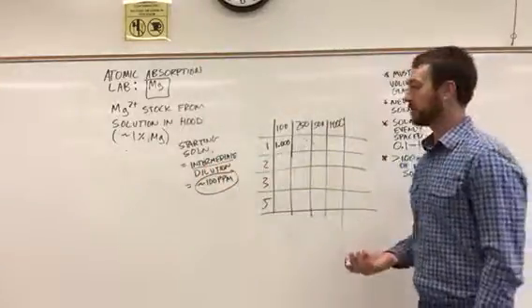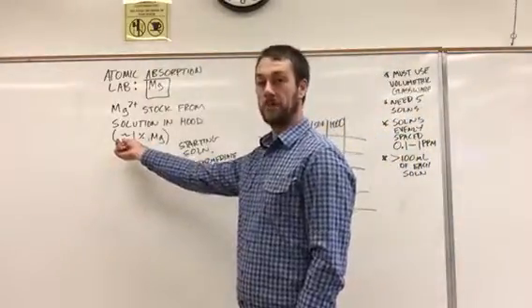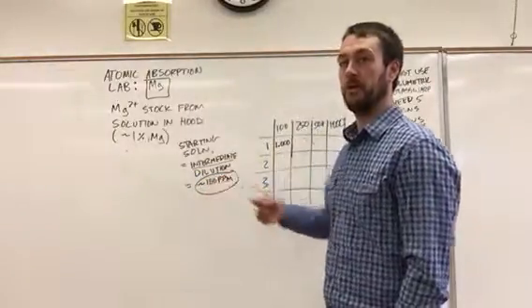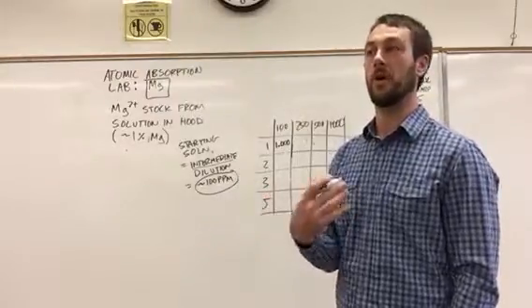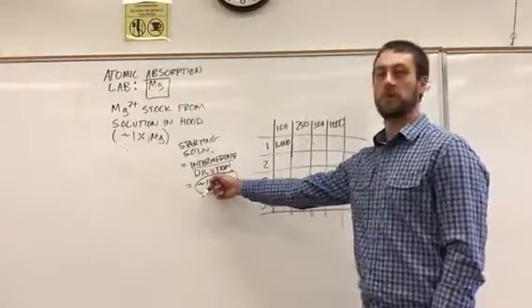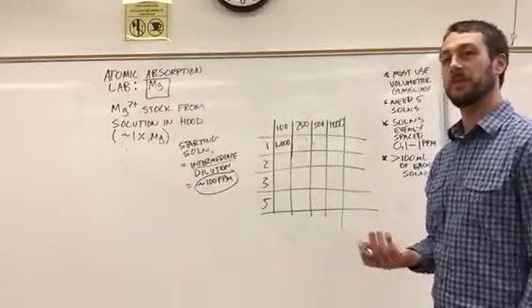And there's a couple things to remember here. One is that the solution in the hood is approximately 1% magnesium, and so this is approximately 100 ppm. But you need to verify the actual concentration based on what's written on the label. Okay, so I'm doing the calculations using 100 ppm, but the solution that you end up making is going to be slightly different.